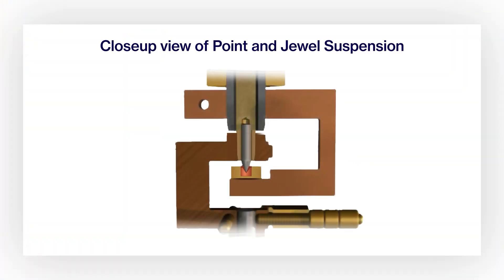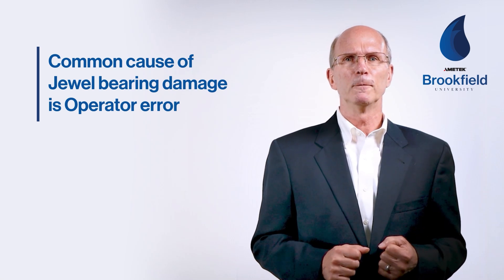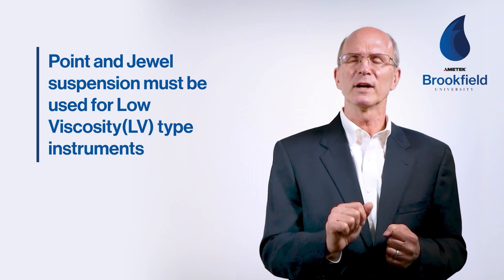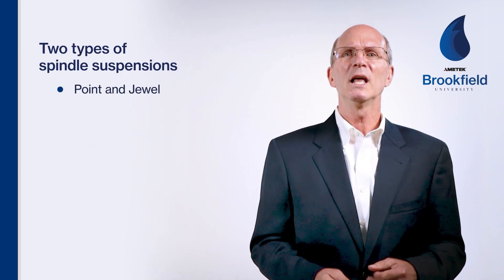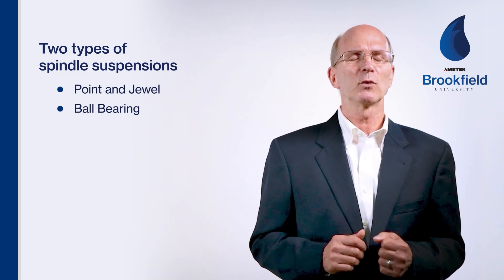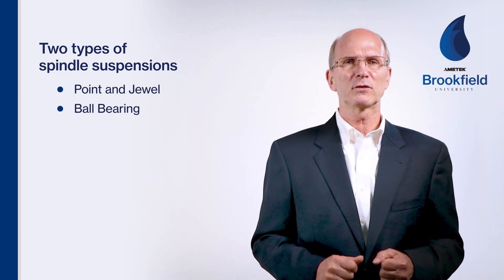Here's a close-up view of the point and jewel suspension. As you can see, the pivot point is attached to the spindle shaft and it rests in the pivot support assembly that holds the jewel bearing. Most jewel damage is usually a result of operator error when attaching or removing the spindle. The point and jewel suspension must be used for LV or low viscosity spring range instruments to provide the most friction-free suspension. There are two types of spindle suspensions: point and jewel, and ball bearing. Most instruments use a point and jewel suspension due to its low dynamic resistance. The ball bearing suspension was designed as a replacement to the point and jewel for a more robust suspension system.